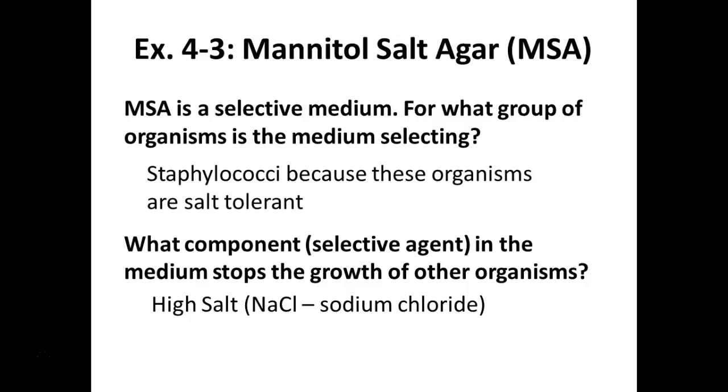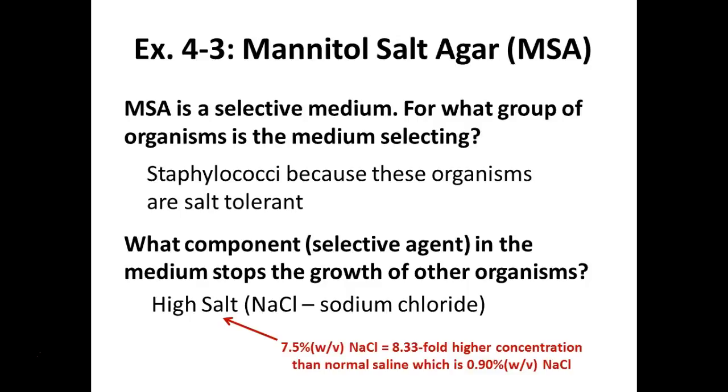But this is important. You need to say high salt concentration, not just salt, right? Most media has salt for isotonic balance. The important thing here is the high salt concentration, higher than normal. Does that make sense to you guys? Okay. And that's how we can normally select for Staphylococcus.